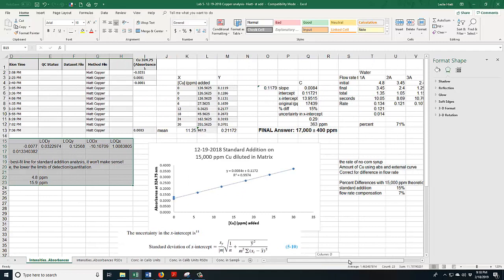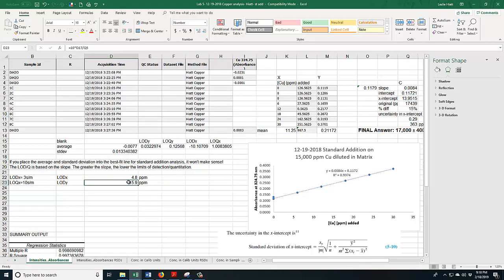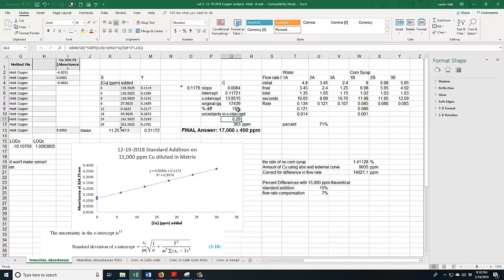You will notice that's interesting, because our x-intercept was below 15.9. So we would need a higher dilution in order to really use this for quantitation. That explains a whole lot of why there's error in this line. You might have gotten something very similar. If you had done less dilution than what I did for this run, which was probably 20 microliters down to 25, you probably got better data.